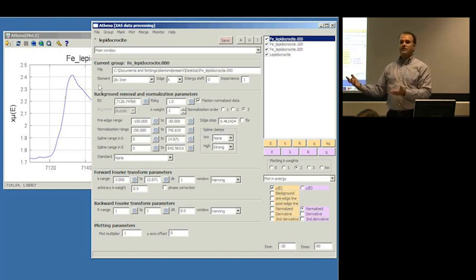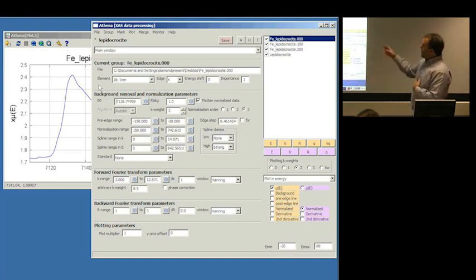So at this level, choose a sensible value that is something in here, not down here, and not over here. Here is not a sensible value, and there is probably not a sensible value, but there or a little bit above or below is probably sensible. Choose a sensible value and do something consistent. Do something similarly sensible for the whole ensemble of data is really the answer there. There's not a right answer. There's just a good answer. And that's the answer to that.